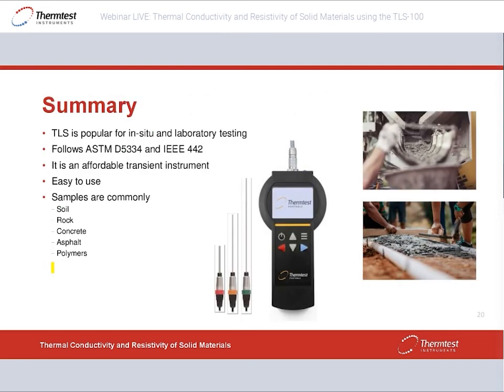And that brings us to the summary of this little presentation, where we can conclude that the TLS is a very popular instrument for in situ and laboratory testing both. For any type of sample that we have discussed now, we have discussed mostly the hard samples, but of course it's also very commonly used for soil, as mentioned in the beginning. So soil, rock, concrete, asphalt, polymers, those are probably the main areas. Follows two standards. It's a very affordable instrument. It's also very popular, as mentioned before.